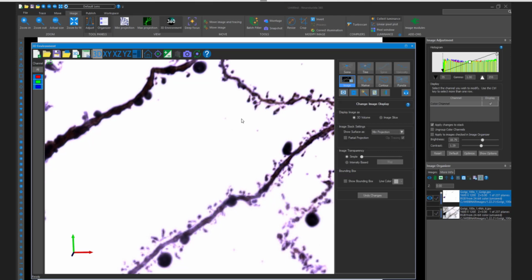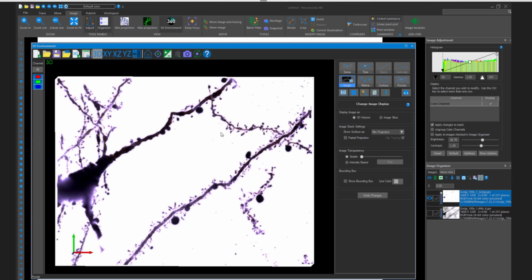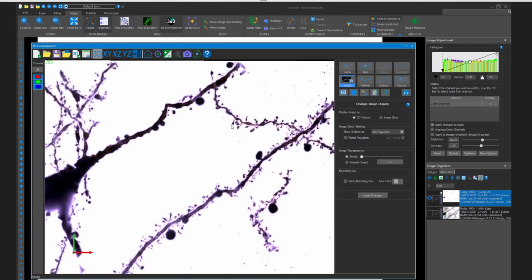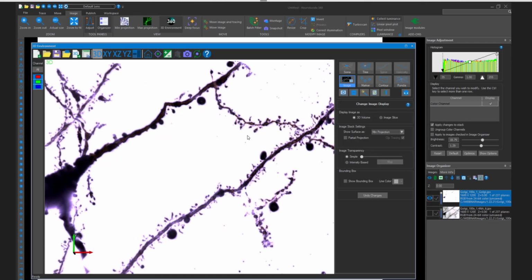What we're doing is opening it as quickly as we can, and then as you work with the image, you click around, you move, and you navigate, it's going to start uploading and getting that resolution to the highest depth that it can. So if you see a blurry image to start, don't worry, nothing's wrong. Just work with your image a little bit, do some rotations, zoom in and out, and the program will update for you and get that resolution to a maximum.